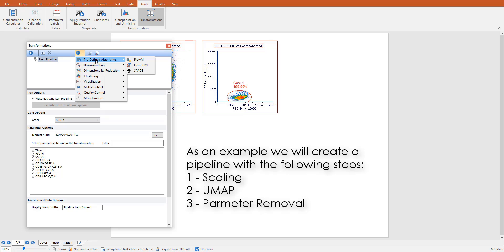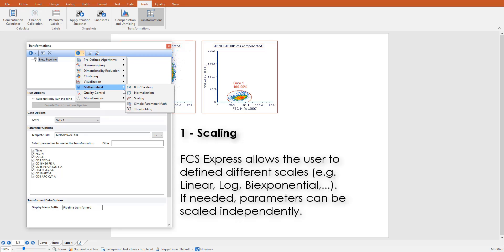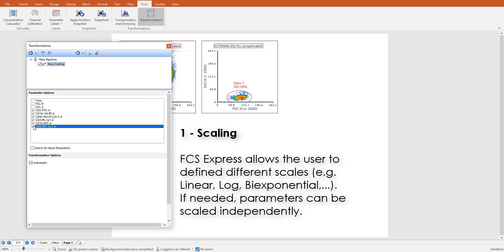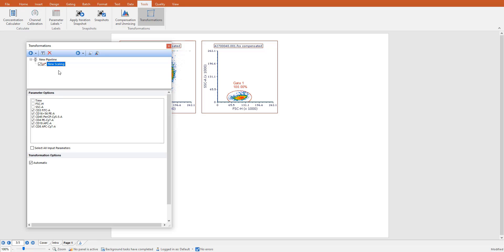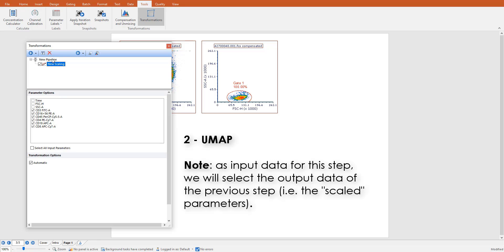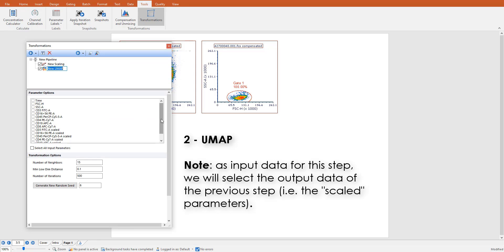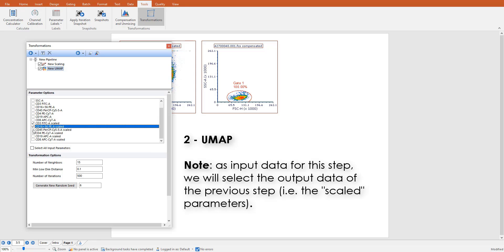As an example, we will create a three-step pipeline. We will start by adding a scaling step and scale all the parameters that will be used as input for the subsequent step. After this step, we will run a dimension reduction using UMAP, and we will select the scaled parameters as input data for this step.